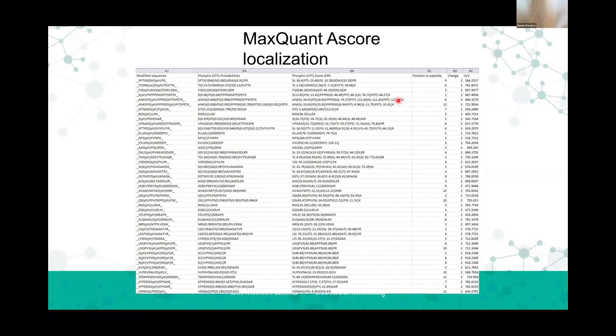We use MaxQuant, and it has an implementation of this that's actually pretty good. And so you can filter on this. There are times when it may give you a 50% score, and you think, oh wow, that's awful. You're grading your student's test. There's an F. But if a peptide has 2 serines and the data shows 50%, it's one of those two, right? You're confident that one of them is phosphorylated.